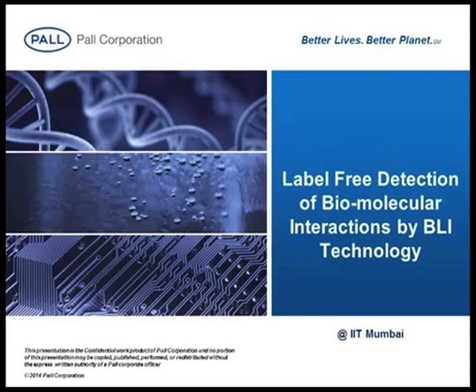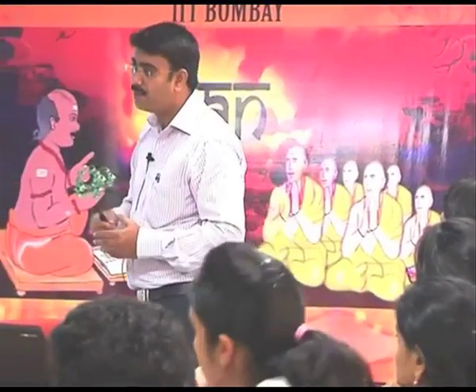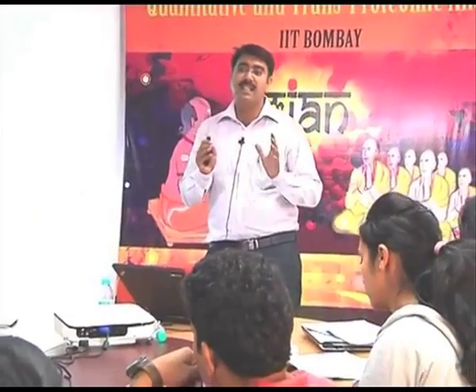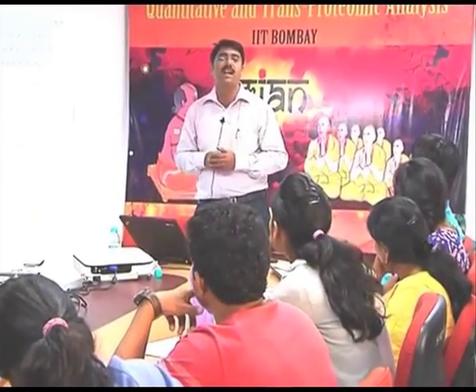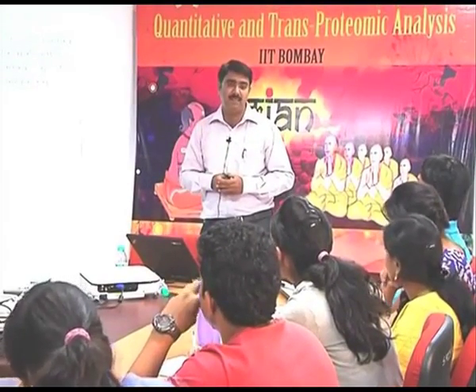But there are other UV spectrophotometry based methods, where you are measuring at 280 nanometers due to the tryptophan excitation, aromatic excitations, or sometimes you are attaching fluorescent tags. Those are called label based. Even in the case of iTRAQ or iCAT based mass spectrometry, you are attaching a tag right there.